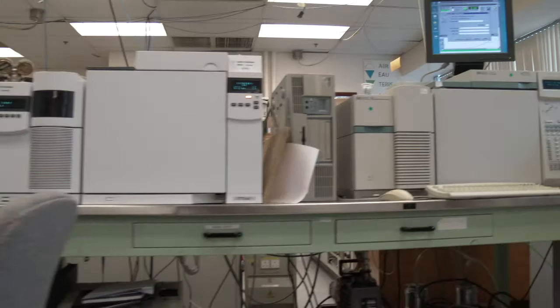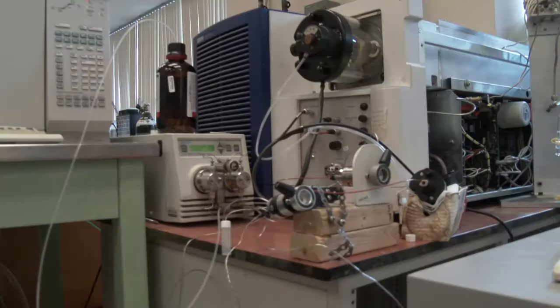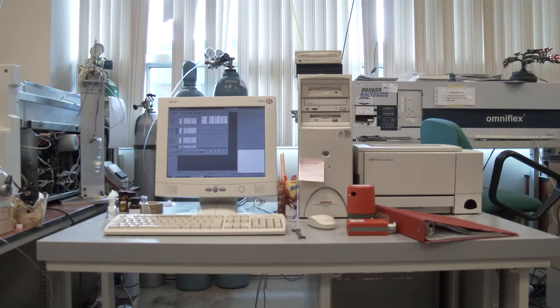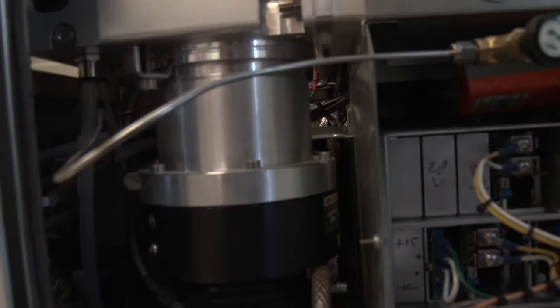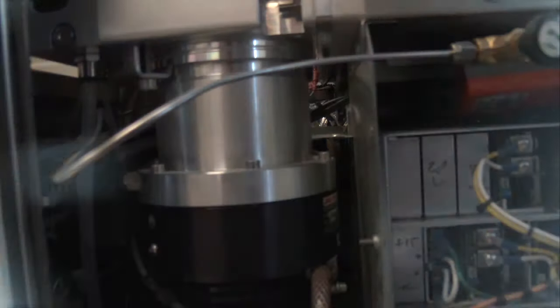In fact, in this region there are two GCMSs, a Waters triple quad, and a Bruker MALDI. This benchtop Waters electrospray triple quad mass spectrometer reaches a vacuum below 10 to the minus 7 by the use of a molecular turbo pump.